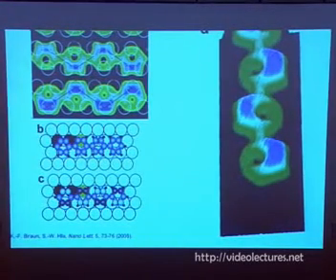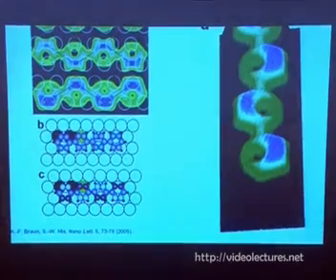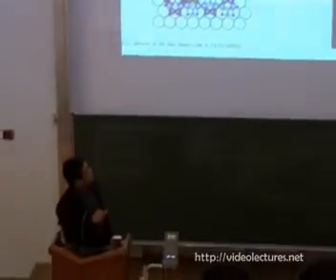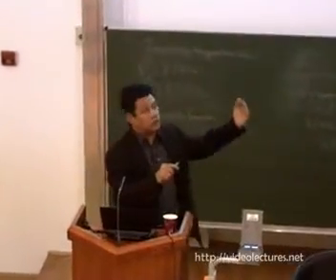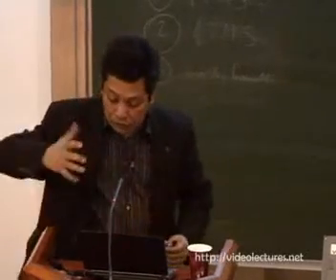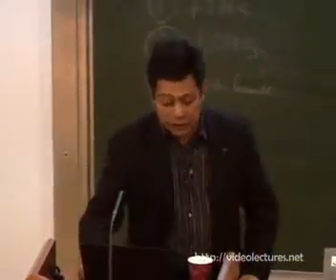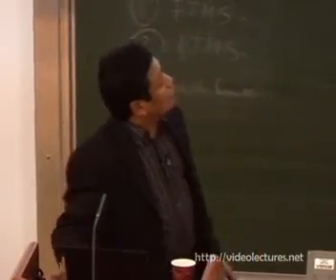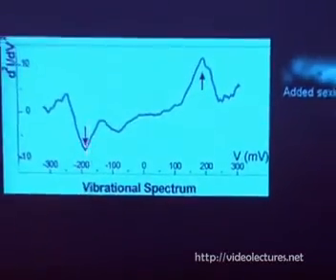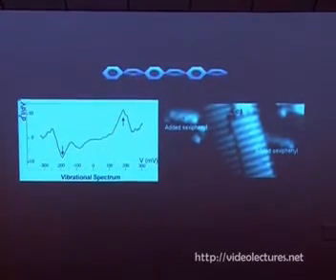Second, we use density functional theory to find out the corrugations. It turns out that when we put in the physisorption conditions, which we calculated by fixing the distance 3 angstrom above, the molecules appear to wiggle, and they are, of course, slightly twisted, the pi rings. This is the calculated pi rings, and it appears that this kind of wiggle is due to the molecule being slightly twisted on the surface. So now we know that the molecules are twisted, and they are physisorbed. We can also measure this vibration with vibrational spectroscopy, the second derivative signal, and it appears at 186 millielectron volt. That signal is due to the twisting of the molecules.